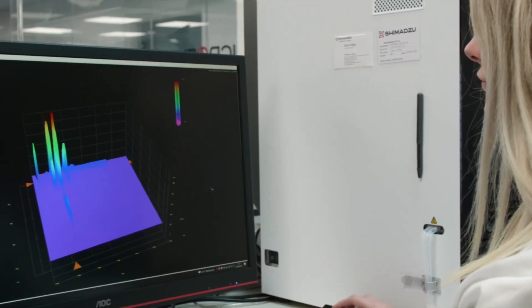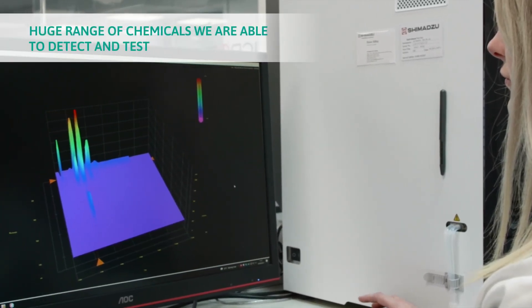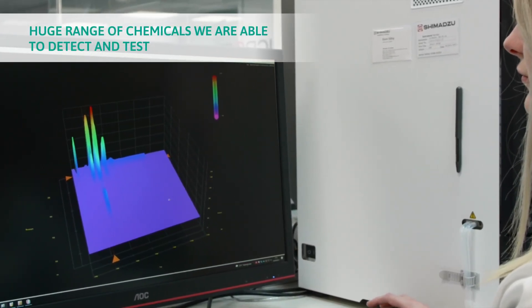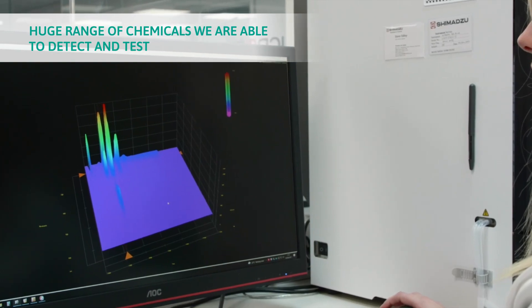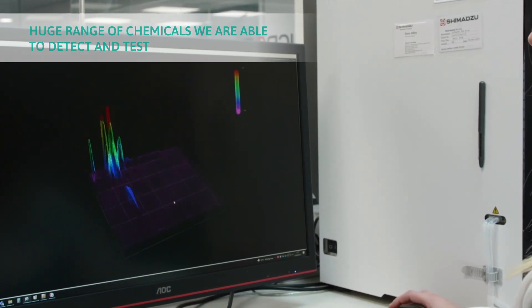With a combination of all the techniques shown in the chemical lab there is a huge range of chemicals that we are able to detect and test. As you can see from all of this, we are truly dedicated to understanding how our products protect you from hazardous substances.